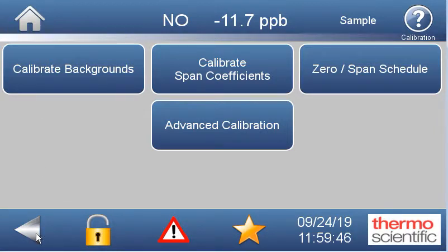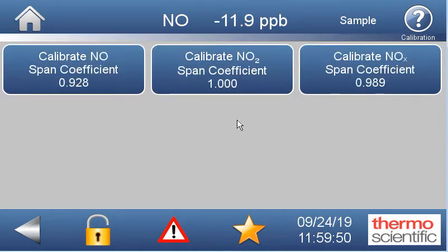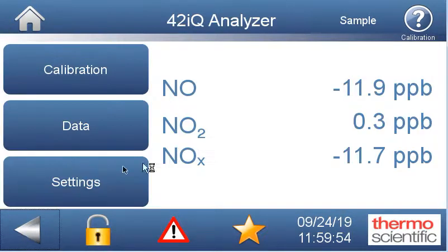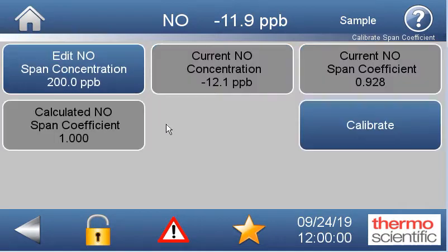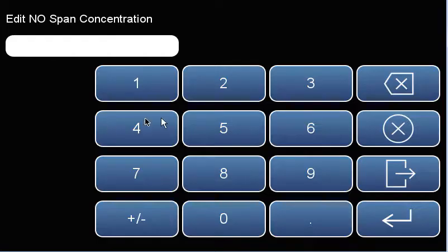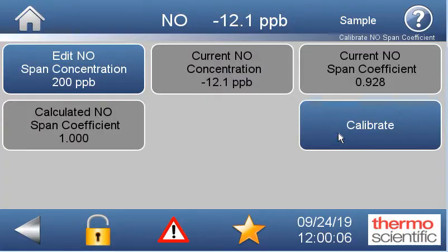Then flow our span gas and use this auto calibration. We go to calibration, calibrate span coefficients, come in here, put in that same concentration that we're flowing — 450 — and hit calibrate. That's going to adjust these coefficients. Now they should end up pretty close to one.